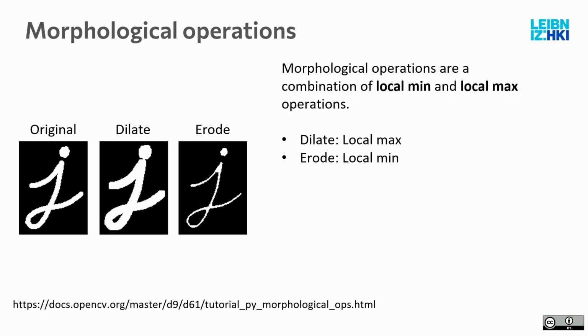So the mask gets all enlarged, because you can imagine when we are nearby a white area, but our current pixel is black. If we take a local area around it and it hits even one pixel that is white, then the current pixel will be made white, so everything inflates a bit.